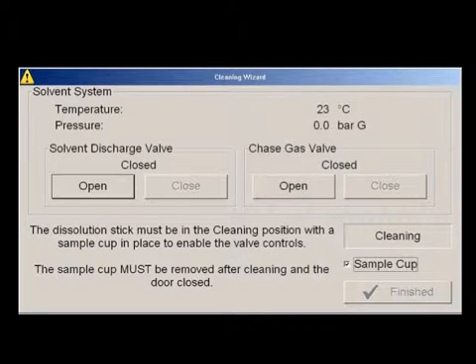So that's basically it. You have to do a little cleaning after you're done. So I'm skipping your experiment, which is like a whole other thing, but that'll be talked about I think in the future lectures in this class. But once you're done here, you're going to go ahead and do the cleaning, and basically we ask that you run a few milliliters of water and EDTA mixture.